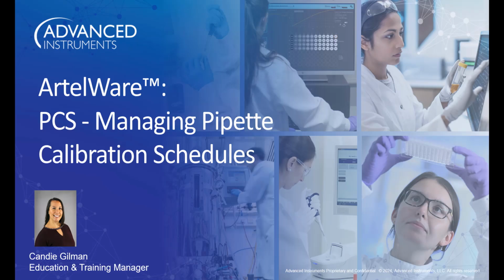Thank you for joining me for this brief tutorial focused on managing pipette calibration schedules to be used with the PCS in the ArtelWare application. I've got some details to share with you, so let's go ahead and get started.